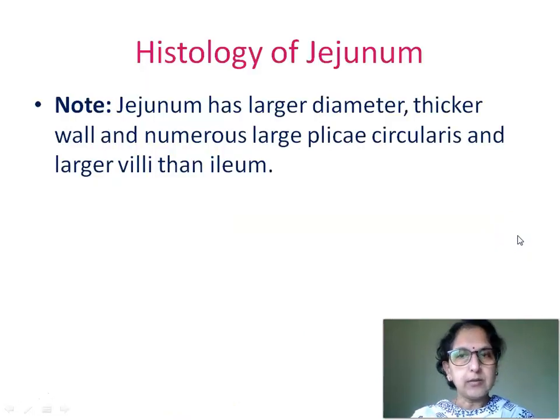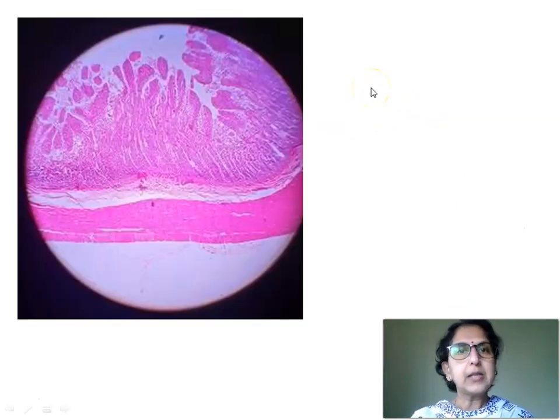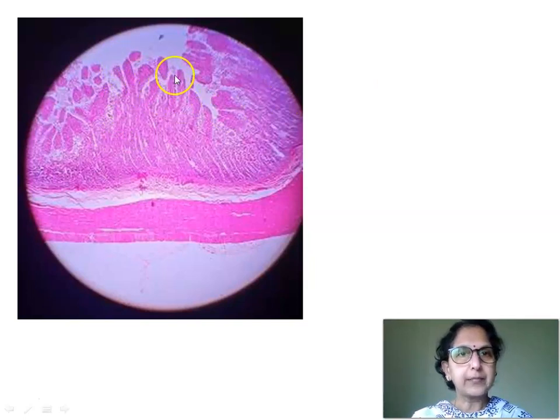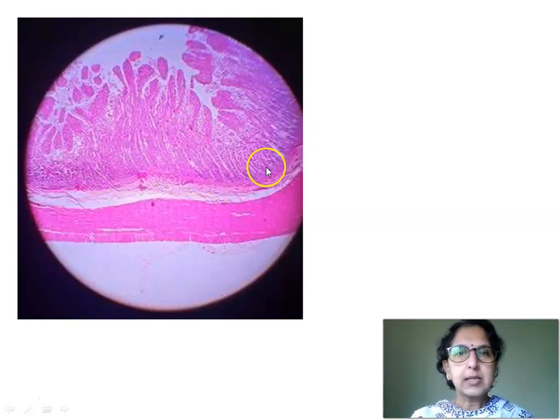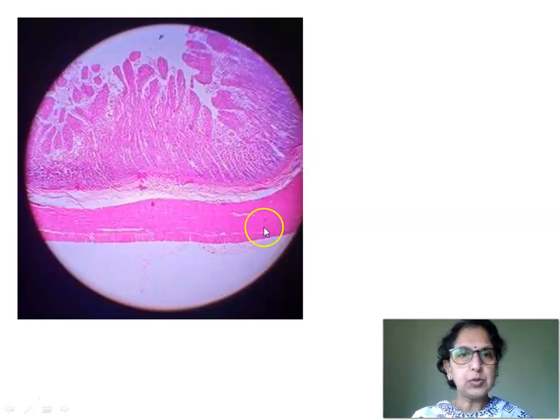Kindly note: jejunum has a larger diameter, thicker wall, and numerous large plicae circulares and larger villi compared to ileum. In a low power view of an H&E stain slide of histology of jejunum, we see finger-like villi, the intestinal glands or crypts of Lieberkühn, the muscularis mucosae, the submucosa with connective tissue, the muscularis externa, and serosa.